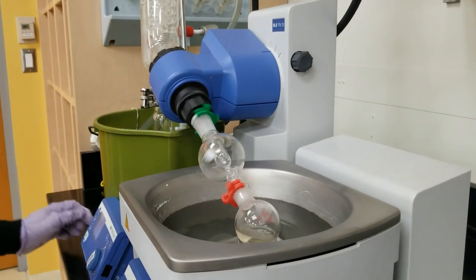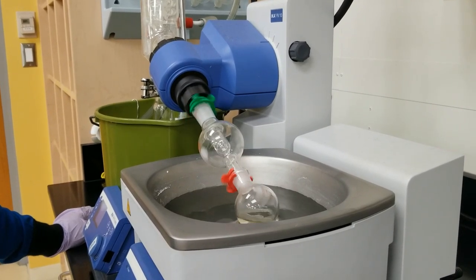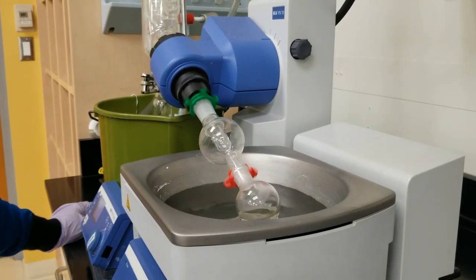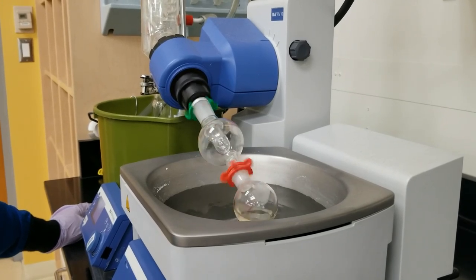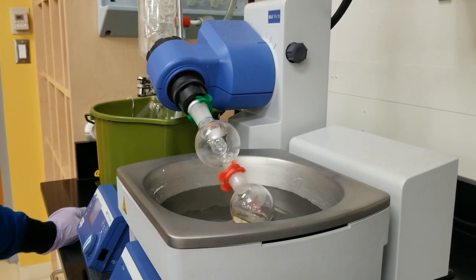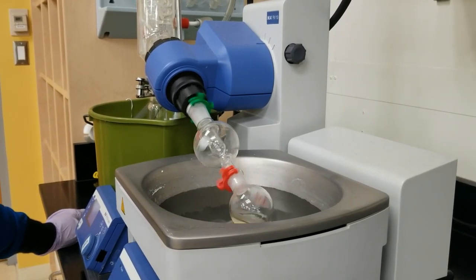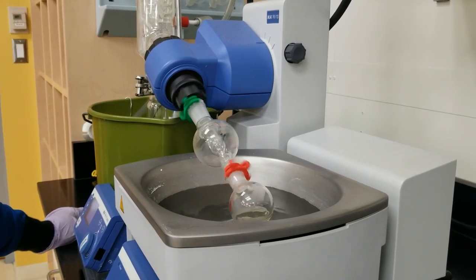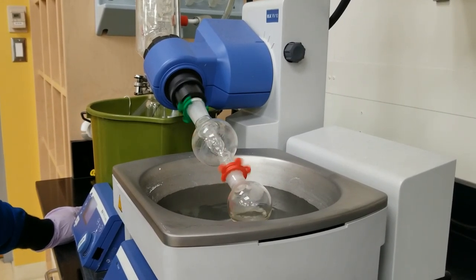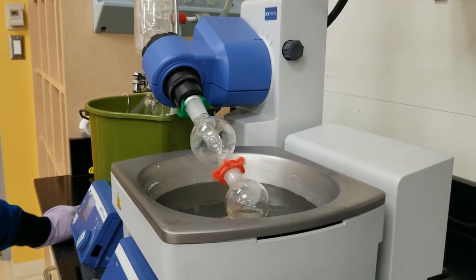So the working principle is pretty simple. This is a phase transition from liquid to gas. And we are reducing the pressure inside this tiny round bottom flask so that the phase transition can happen at room temperature. But if you need higher temperature, you can turn the heat on of this water bath. And at the end, we will be able to see the solid material in the round bottom flask once all the liquid is evaporated into the solvent trap.